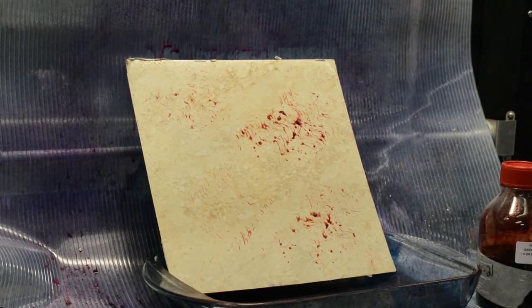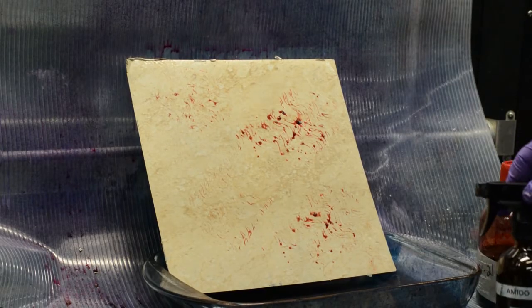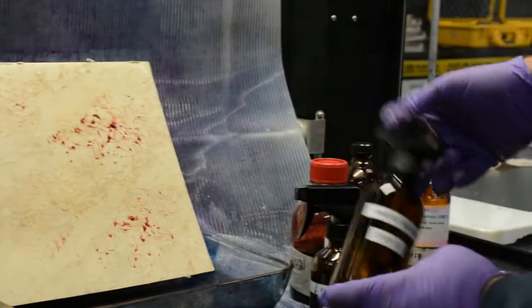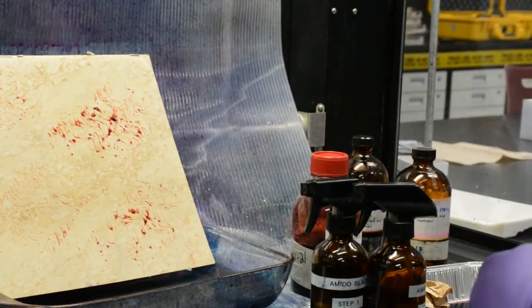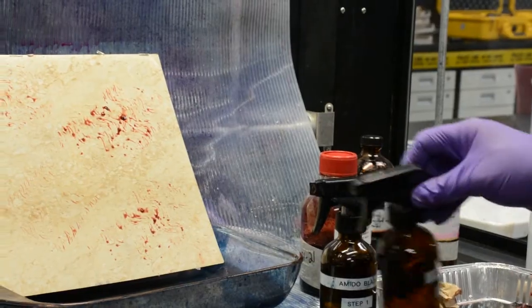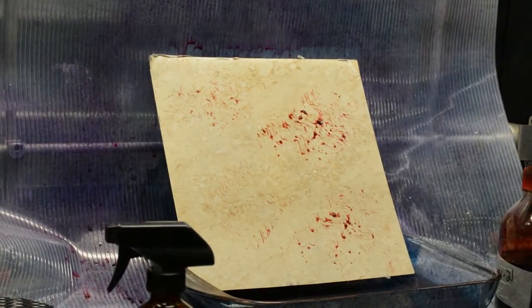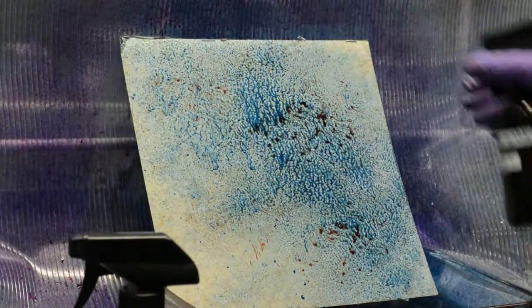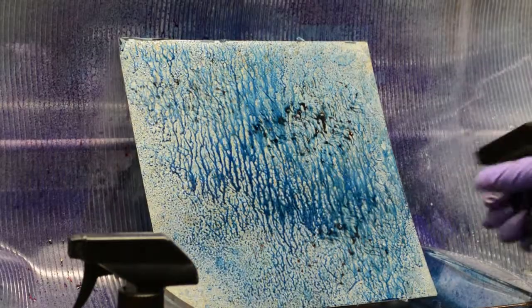Okay, so as I said, we have the 3 steps. Step 1 is the Amido Black itself. Of course, these are all spray applications. The second one here is the fixative. And we have our distilled water as the 3rd application here. So we'll start off first with our step 1 spray. You can see obviously the difference in color of the Amido Black versus the vibrant pink color of the Hungarian red.